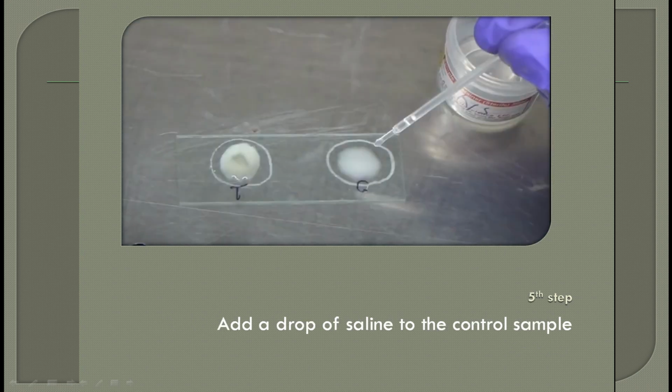After adding that to the test sample, we take a drop of saline and then we add it to the control sample. Again, we are actually trying to prove that it is the human plasma and the bacteria which are reacting, and not the saline and the bacteria which are reacting to give the reaction. That is why we are adding a drop of saline to the control sample. That is the entire point of a control. We know this from the basics of science, right?